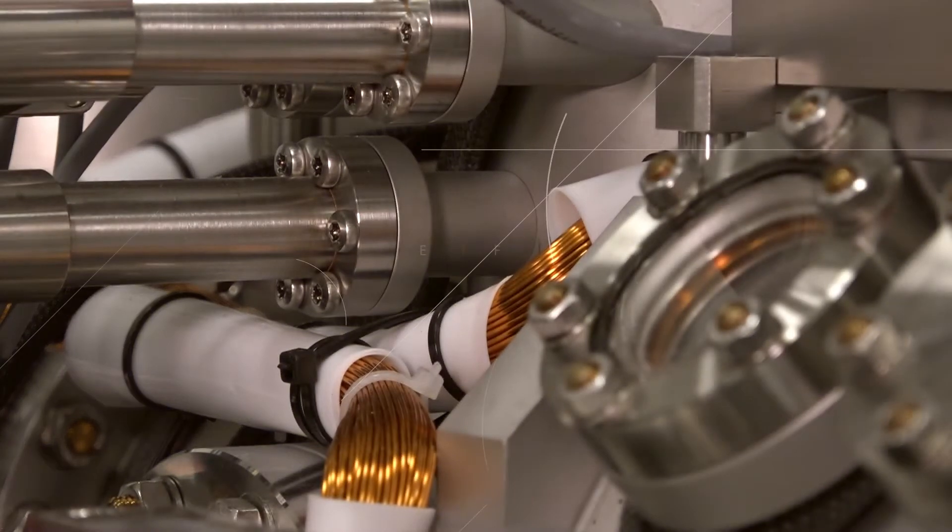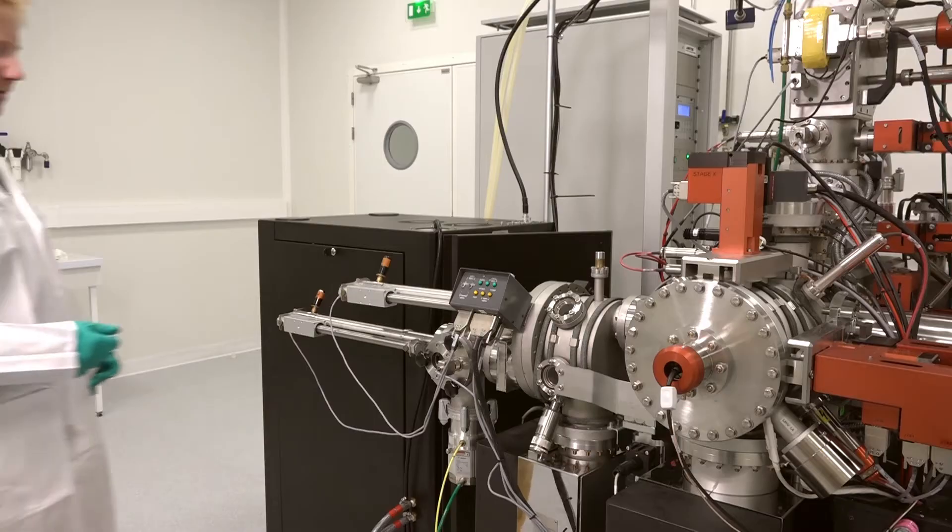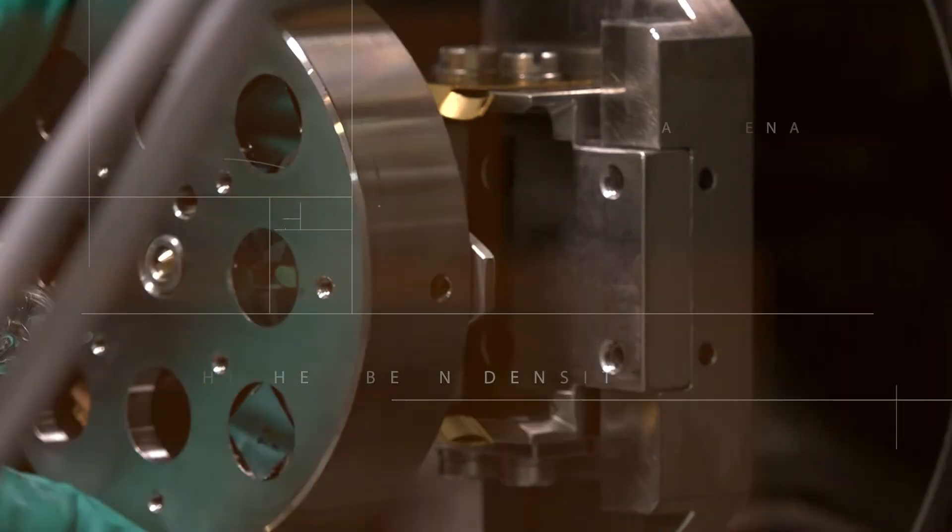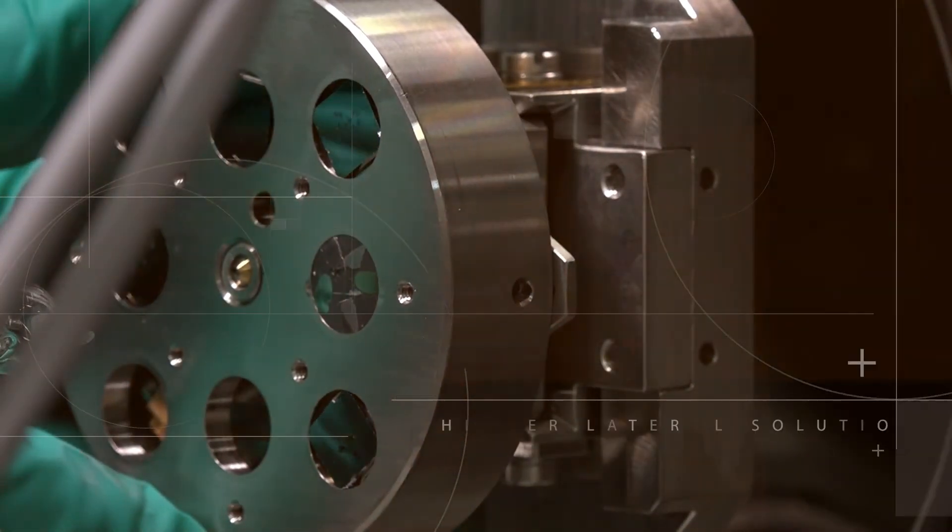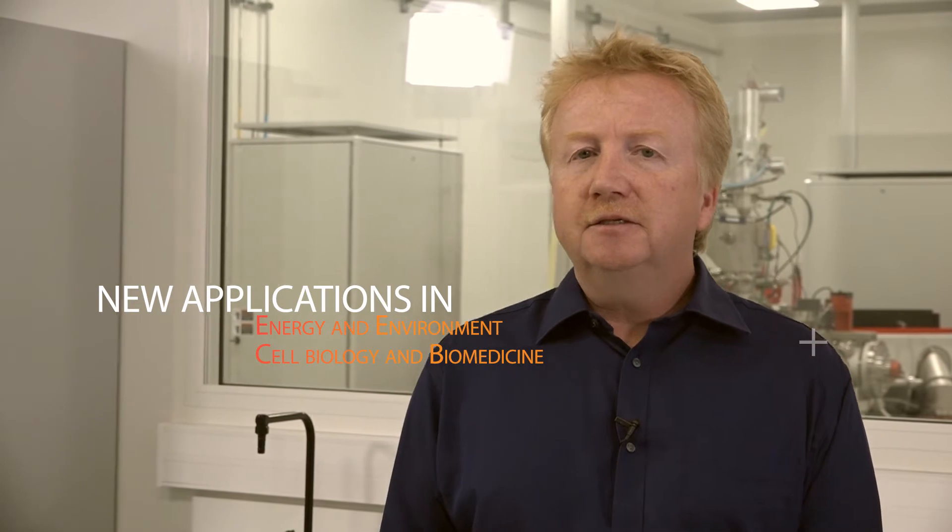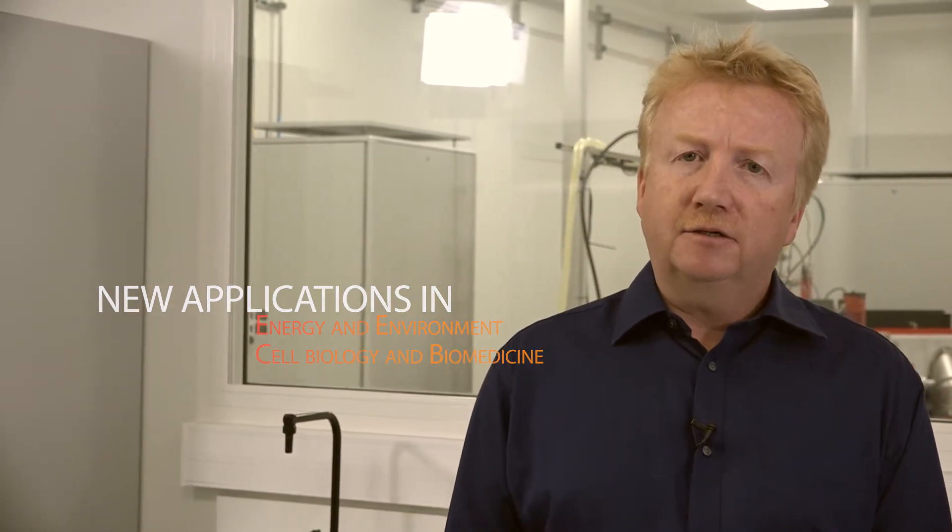Our nanoSIMS is equipped with a new primary oxygen ion source developed and validated together with the nanoSIMS constructor CAMECA, offering new research possibilities with high sensitivity and high lateral resolution.